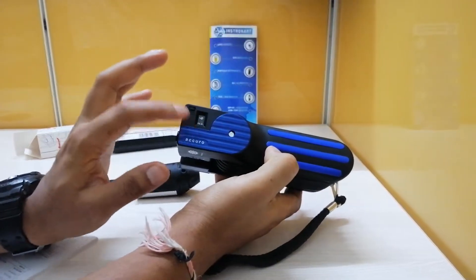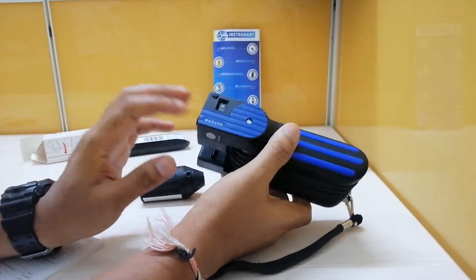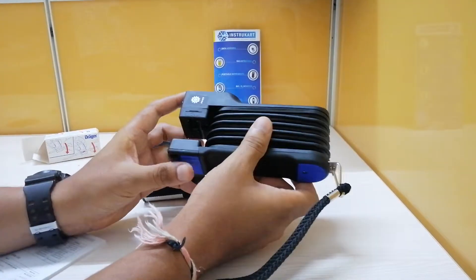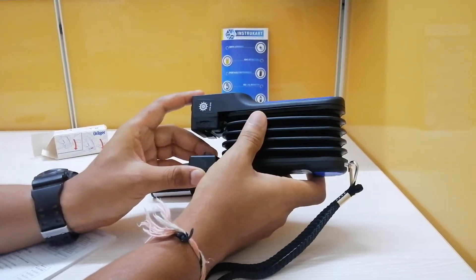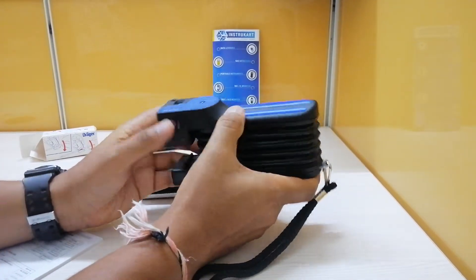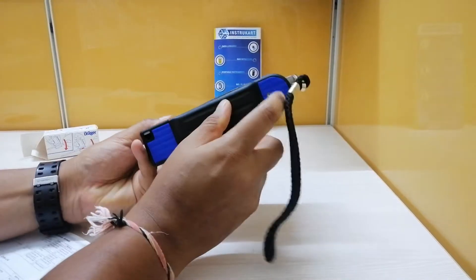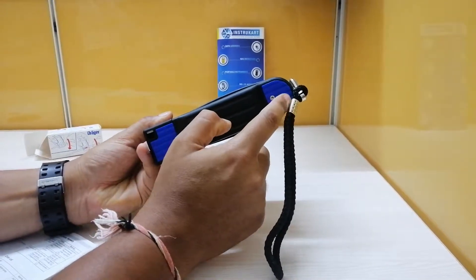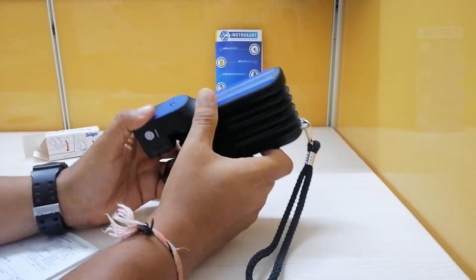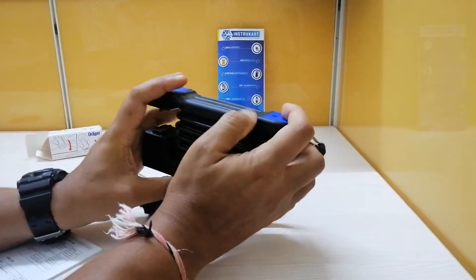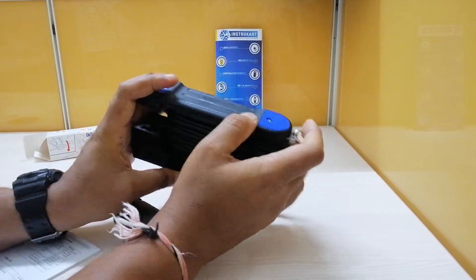The stroke counter will give you the count of how many pumps you have done and an end to stroke indicator. Then there's the bolt to secure the lower pump plate in place and a holder to break the tube. You can use this one, and the loop handle.